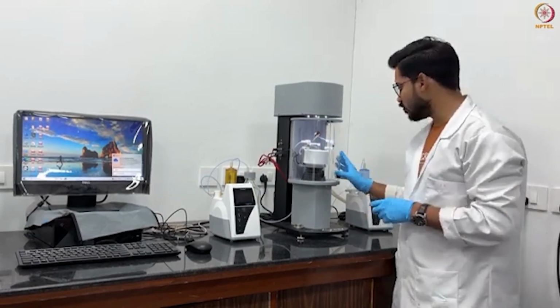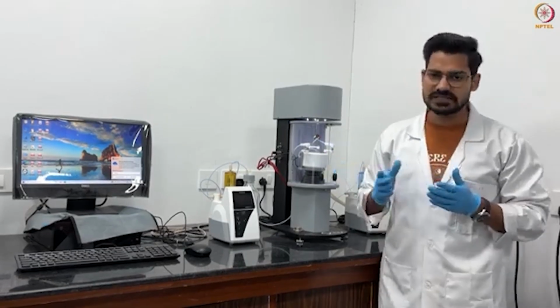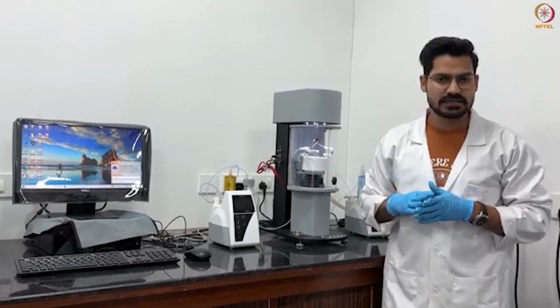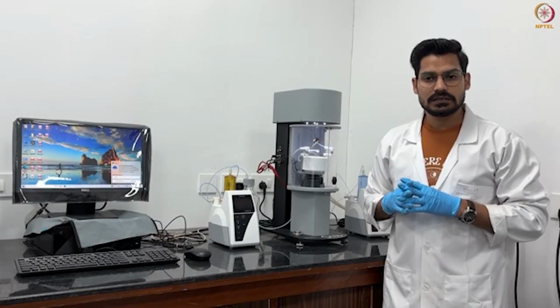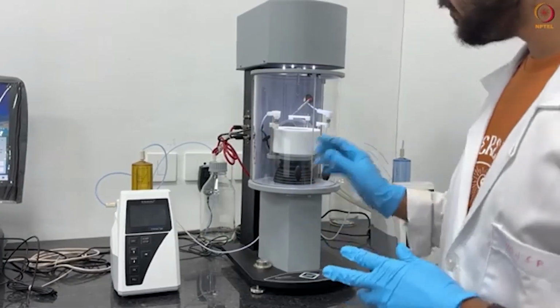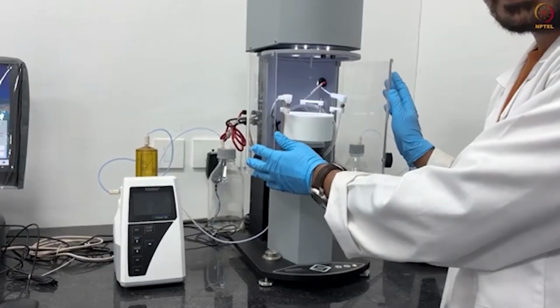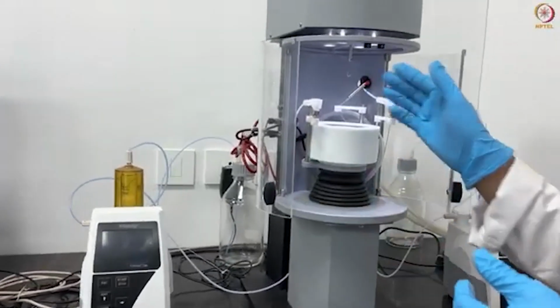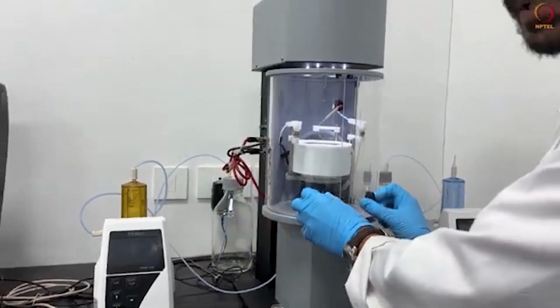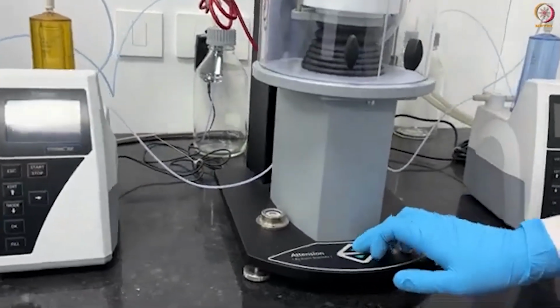This is a special vessel where we have the sample. Or you can use another type of small vessel that can go inside, or you can fill your sample directly in this present vessel. This vessel is connected to the thermostat that will manage the temperature using the bath system. Also, you can see here the balance where you have to hang your plate, your ring type plate or whatever type of plate you want to use. To use that, you have to hang it very carefully.